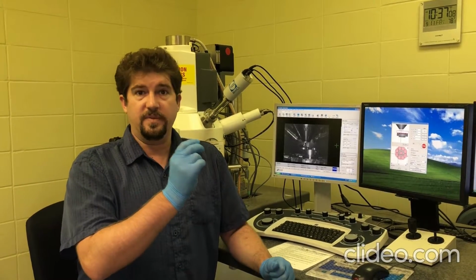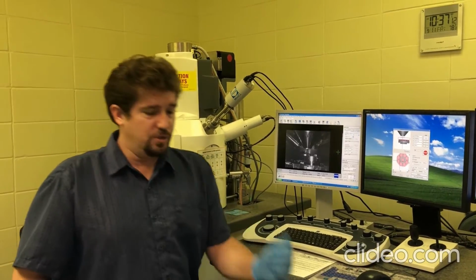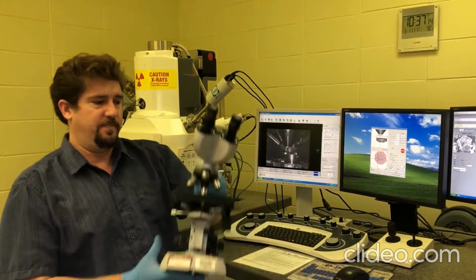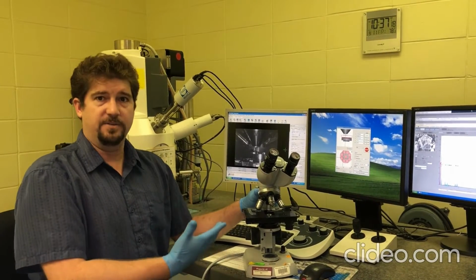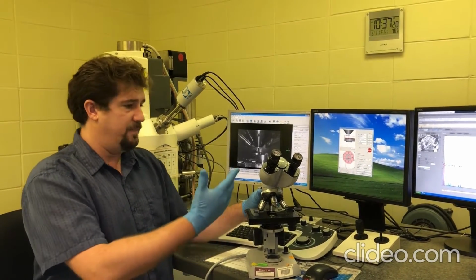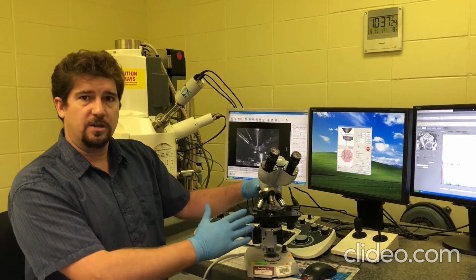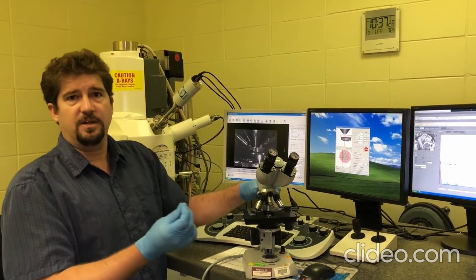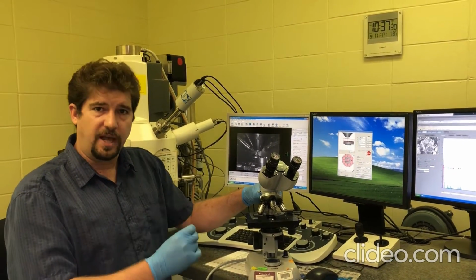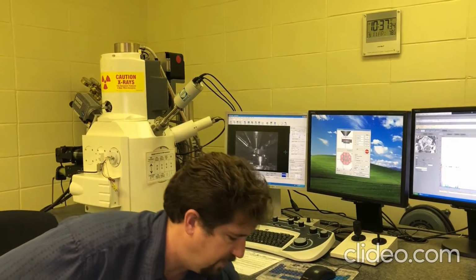Okay, so microscopy is the ability to take something that's really small and magnify it and make it really big. And usually, during people's education, they will use something that looks like this. Now, this is a compound light microscope, and it is used to magnify things, right? But this machine here uses light to magnify a sample. But the machine I want to talk to you about today doesn't use light. It actually uses electrons to magnify your sample, all right?